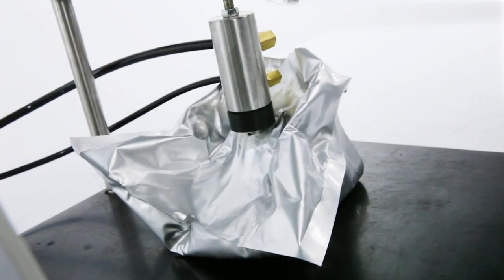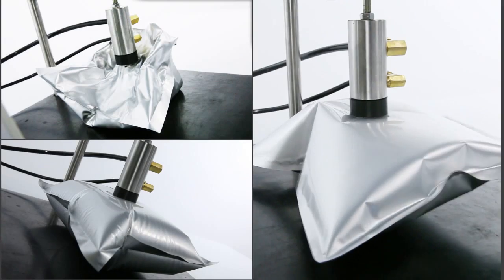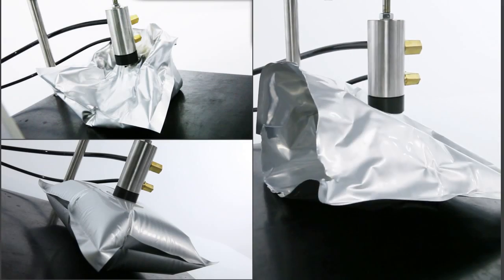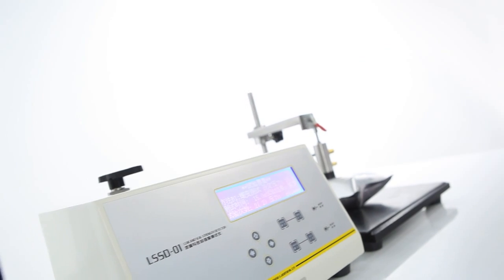This instrument can perform burst, creep, and creep-to-burst tests of complete packages. Under the creep testing mode, it can determine the test result automatically to bring superior test accuracy.